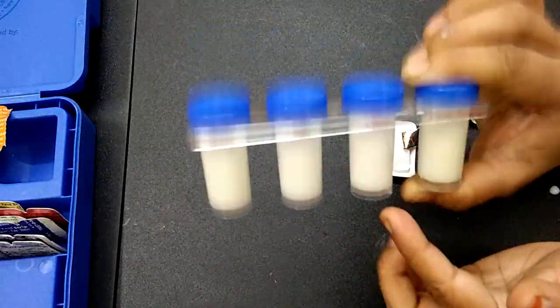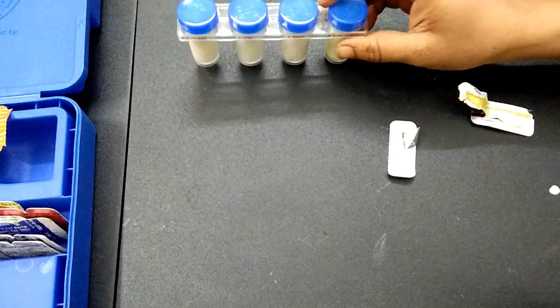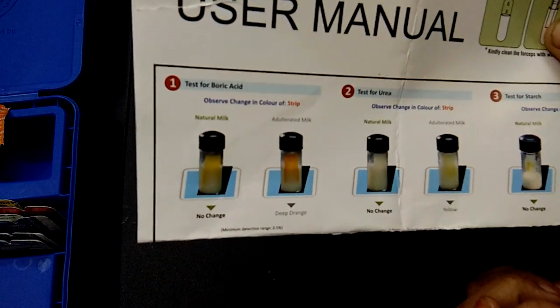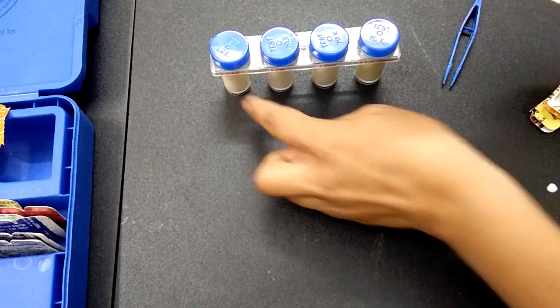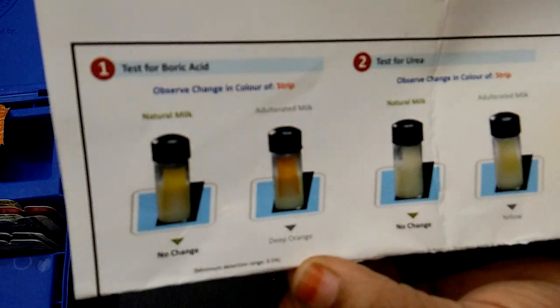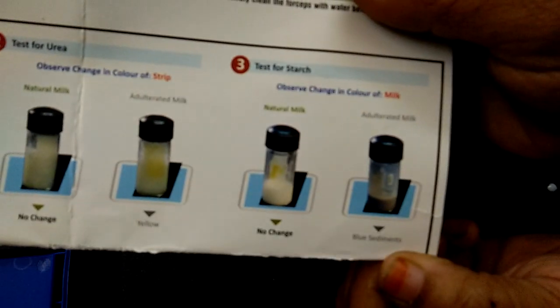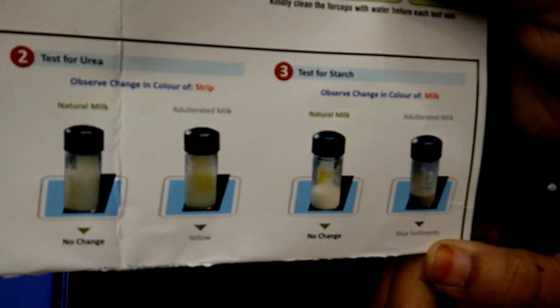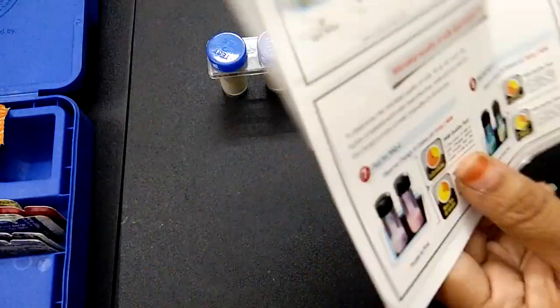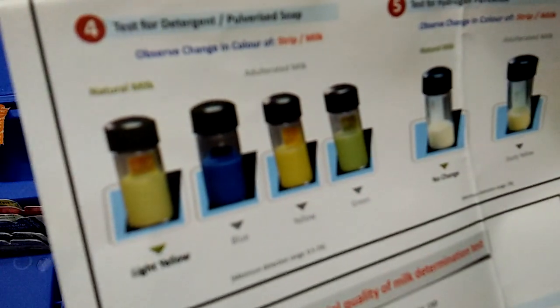Let's shake the tubes and keep them for 5 minutes. Meanwhile, let me explain the color changes to watch for: if the boric acid tube changes to deep orange, the milk is adulterated. If the starch tube changes to blue, the milk is adulterated. If the detergent tube changes to blue, yellow, or green, the milk is adulterated.